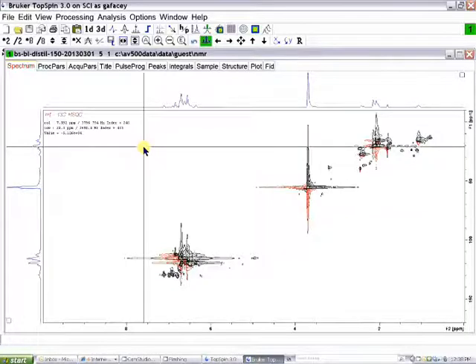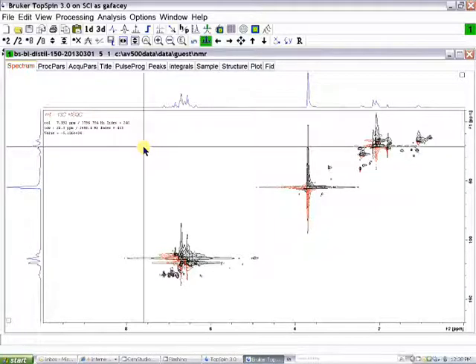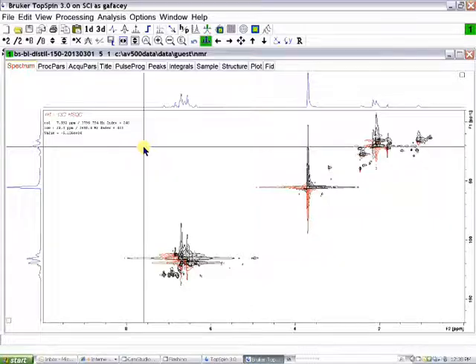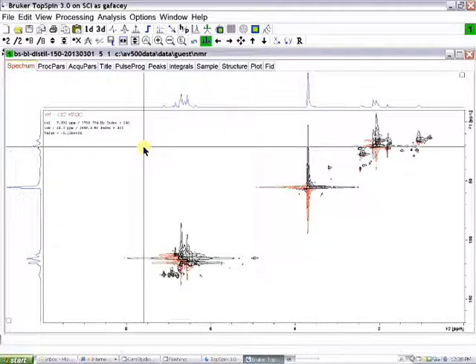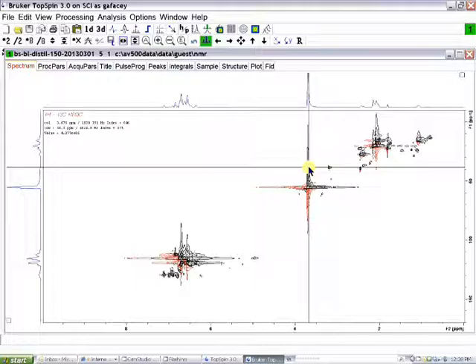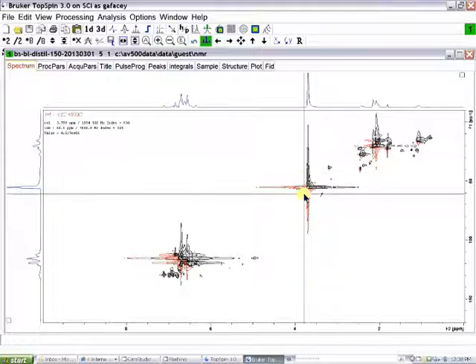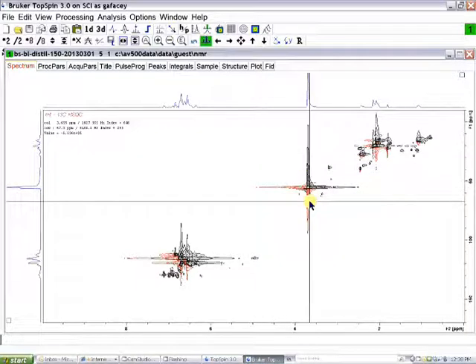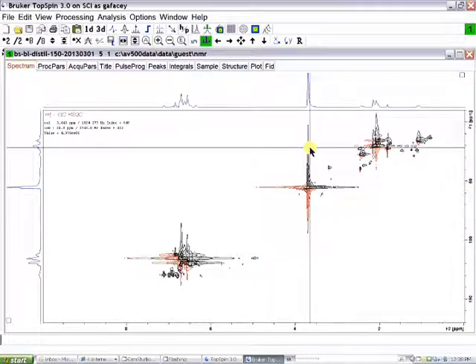I've imported a 2D HSQC experiment that is not phased. We can tell it's not phased because I have the colors set up such that the black contours are positive and the red contours are negative.